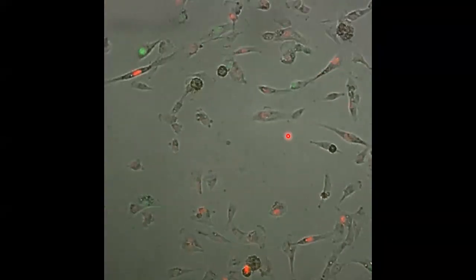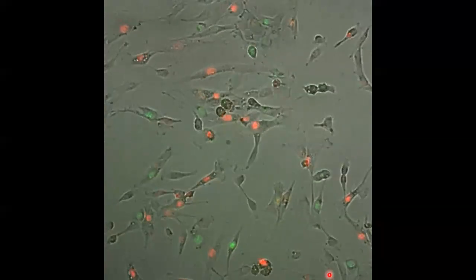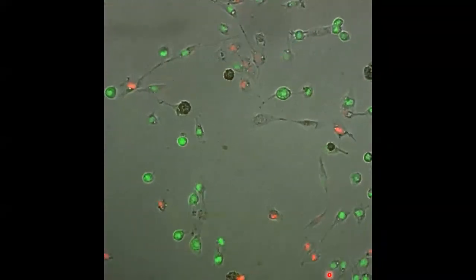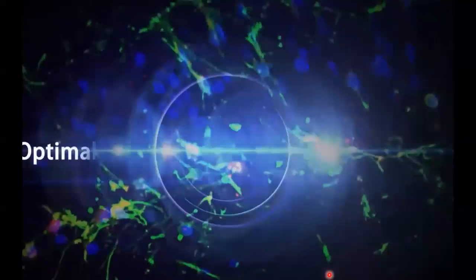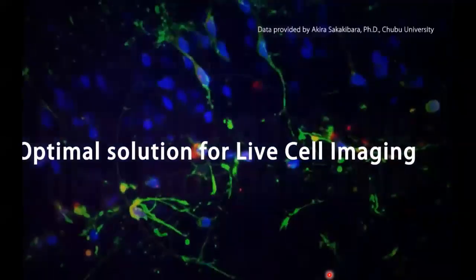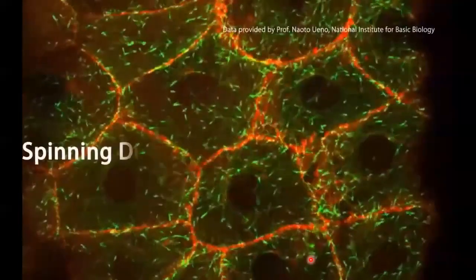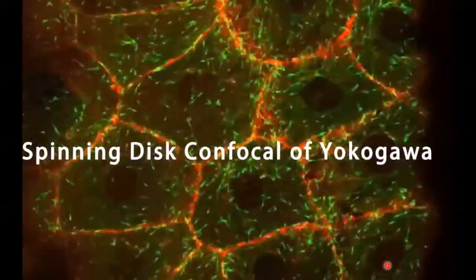And when they are in, I think, mitosis, they just lose all the colors. So this is something you can do. This is, I think, a 12 hour video, or several hours. And to show you what the company sells on their website, they can also look at more complex behavior of neurons or cells over another layer of cells.